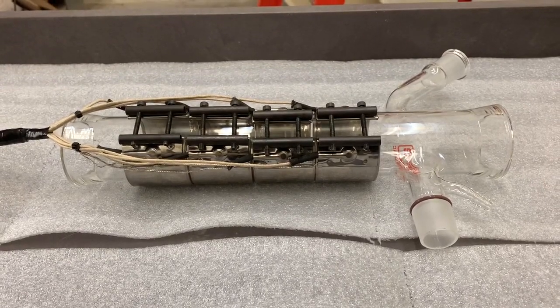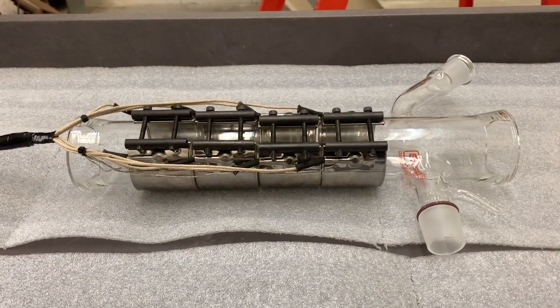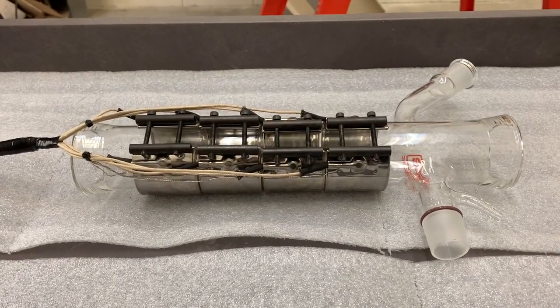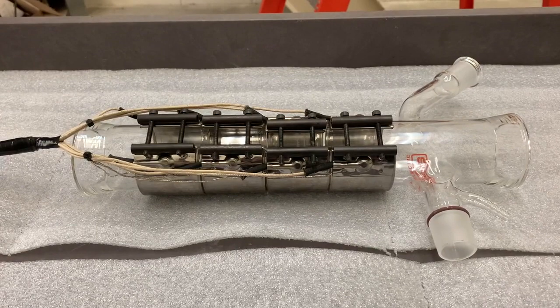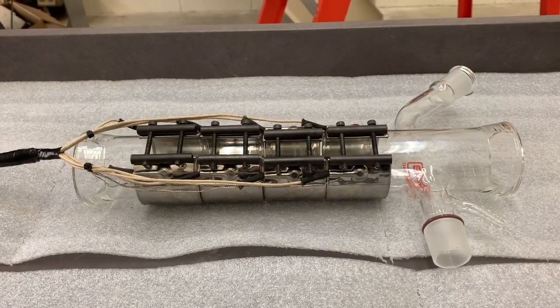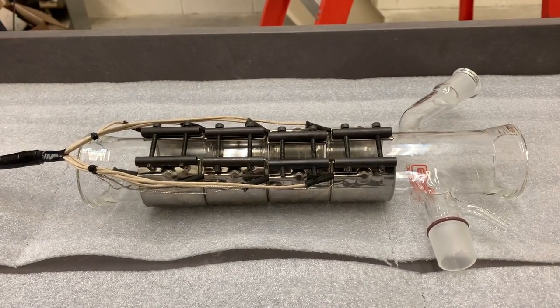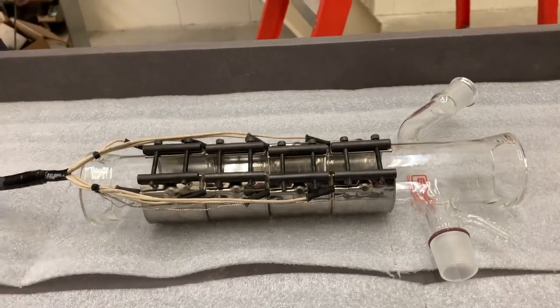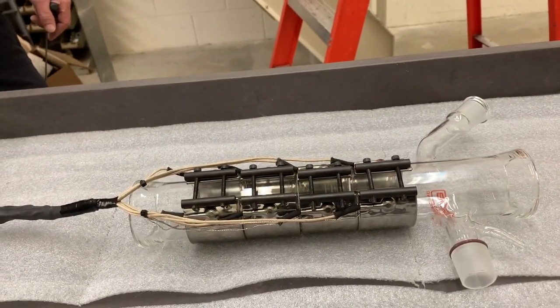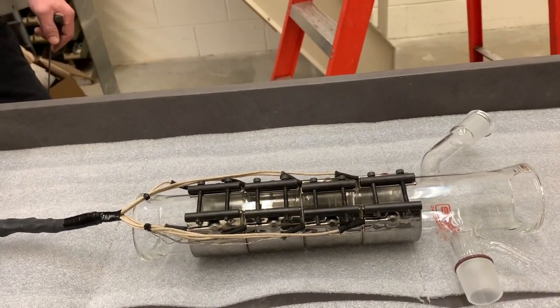The metal band heaters are a steel external piece, and inside what's actually heating is a nichrome wire. That nichrome wire is encased in mica, which separates the wire from the stainless steel outside. The risk when taking them apart is that the mica cracks enough and the wire inside touches the stainless steel, causing a short.